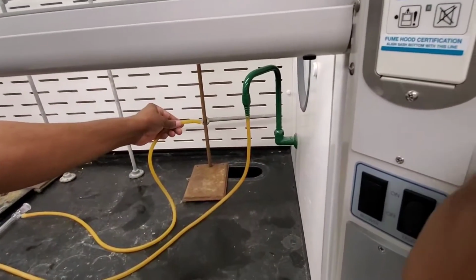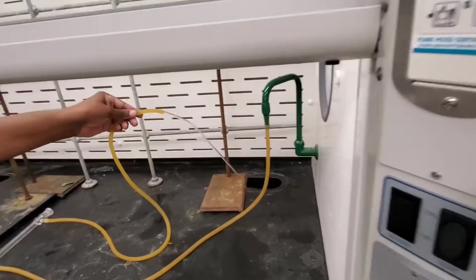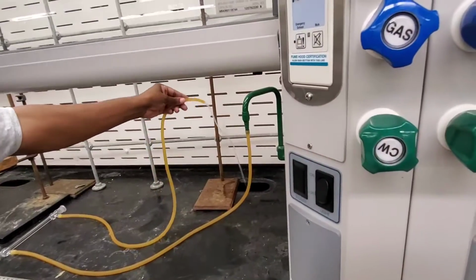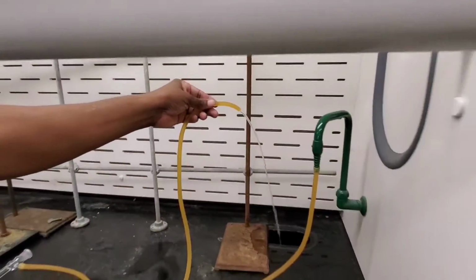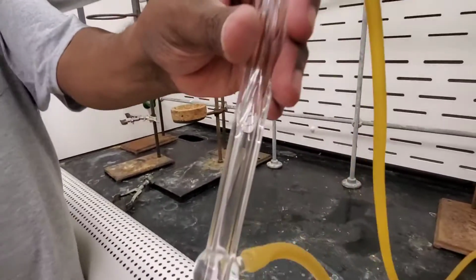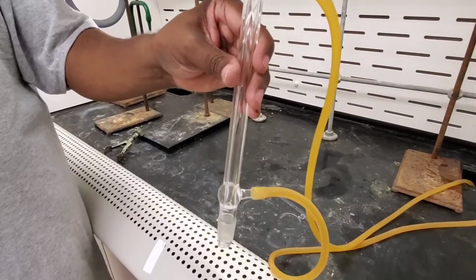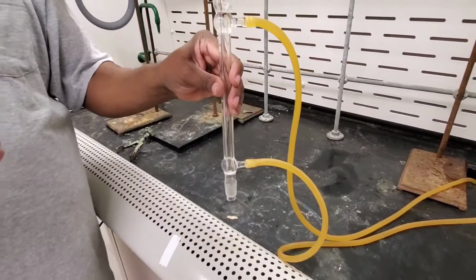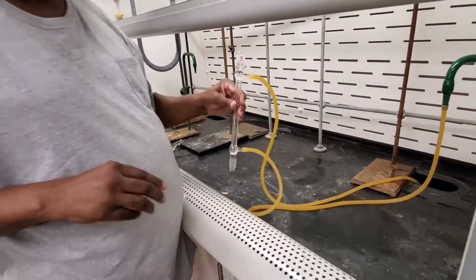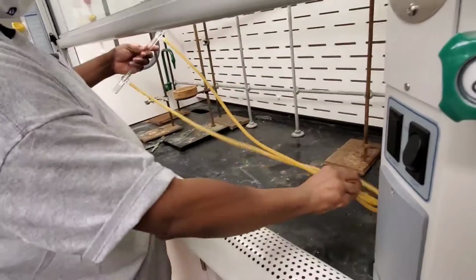And let's just show you the rate. You don't want this rushing through. This is too high of a rate. What you want is a little less. Something like this is probably good, or even less, okay, of a flow. Then you could see there is no leak in here. And at that point, when you're satisfied that there is no leak, then you could put it on top of the round bottom flask. Because some of your reactions definitely don't like water. Water in them is going to just mess it up and you'll have to begin all over again.